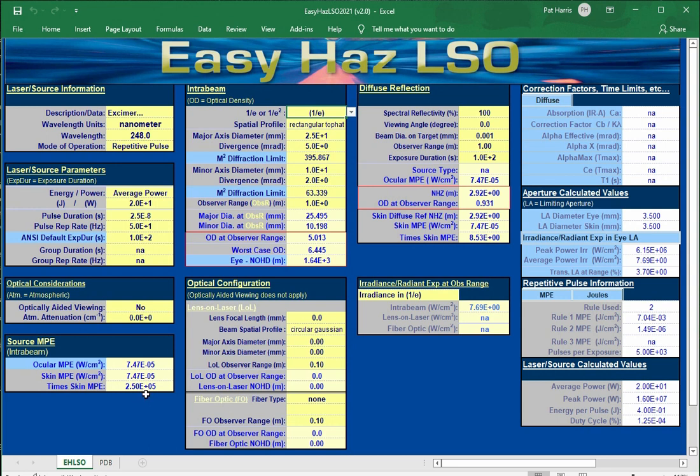He kind of had the raccoon eyes, and what I assumed was a sunburn on his face and on his hands is when I first noticed it. I wondered, maybe he was working outside, didn't have gloves. I didn't know. But as we got to talking, we realized that he tunes this thing up every day, and it takes him 10, 15 minutes to do this. And so I directly asked, is what appears to be a sunburn from you being outside in the winter, skiing or something? No. Turns out it's coming from the UV laser.